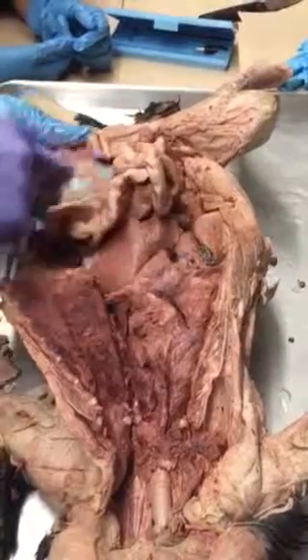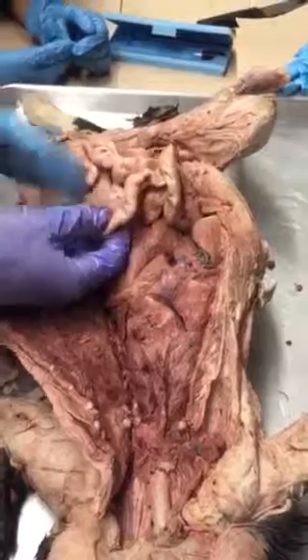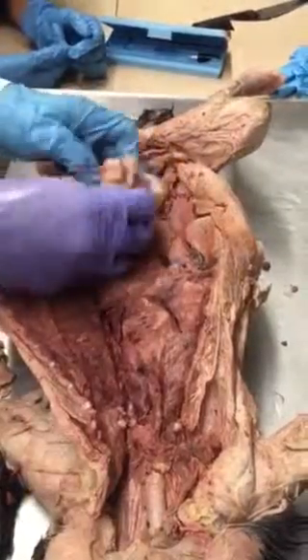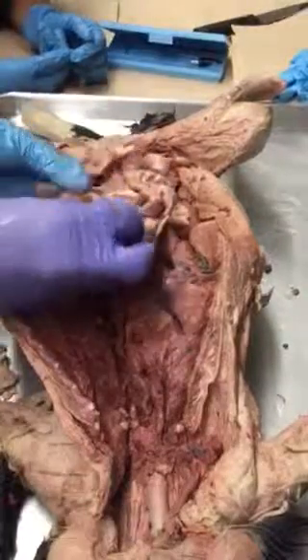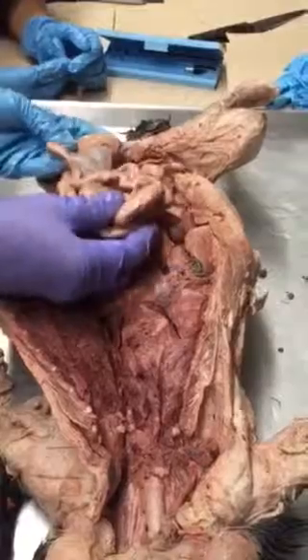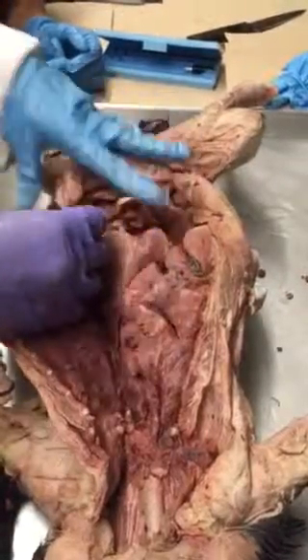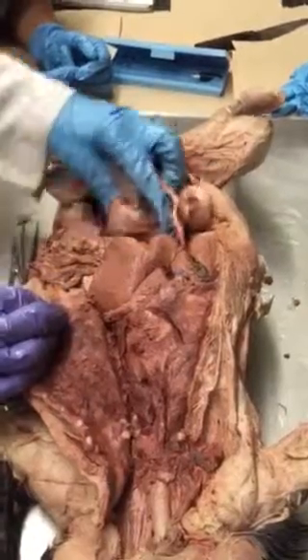All of this membrane here, with the arteries and veins passing through, is called the mesentery. The mesentery holds all of the intestinal tract in place and also provides the vasculature for it. So we get lots of blood supply to the intestines. Since it's a nice long tube, we want to make sure everything has enough blood for functioning properly.